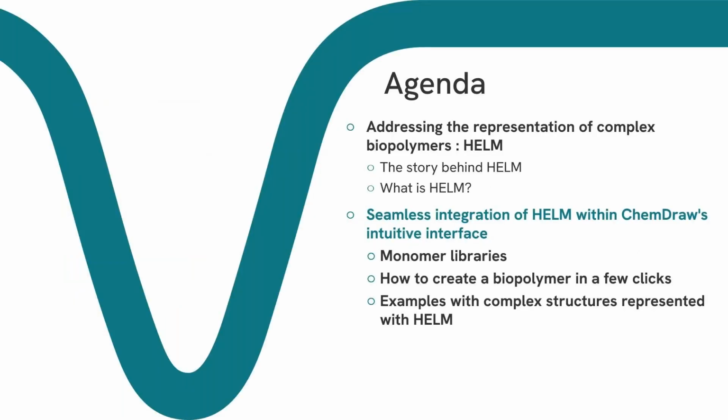Our agenda today will be divided into main parts. First, there will be an introduction about representing complex molecules using a standard called HELM. I will tell you a bit more about the story behind it and what it is. After I've done this introduction, I will pass the baton on to Lindsay, who will show you directly within Signals ChemDraw how you can represent these complex biomolecules.